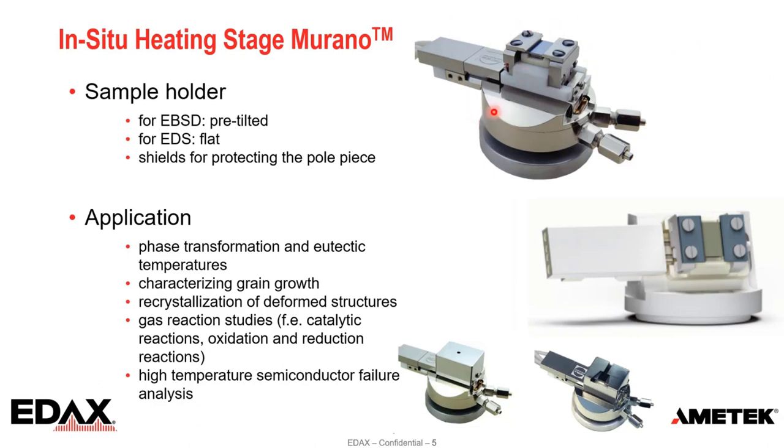Above you can see the flat sample holder and underneath on the right edge, you can see the tilted one. The different sample holders can be used for different applications like for EDS or for EBSD. On the bottom of the slide, you can see the shields which are used for the heating experiments, as one has a hole and one has an open space, which is used more for the EBSD analysis, but you can also use it for EDS analysis. The shields are necessary to protect the pole piece from heat radiation, as you will perform the experiments at higher than 400 degrees.